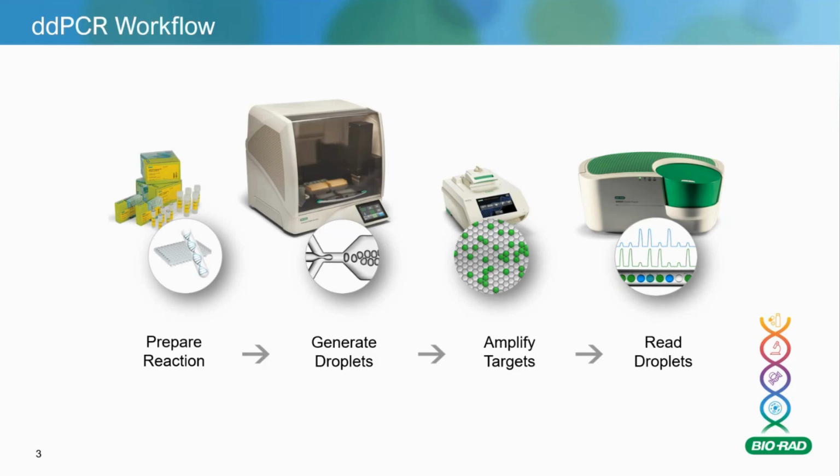Once you've done the droplet generation, you move it to the amplification in a thermal cycler. Then you do your droplet reading step in a droplet reading system, and that's done on the 96 well plate. In that system, it picks up all your droplets that have been thermal cycled, and singulates them like a flow cytometer, and then it reads each droplet one by one. So that gives a good understanding of how the process works.